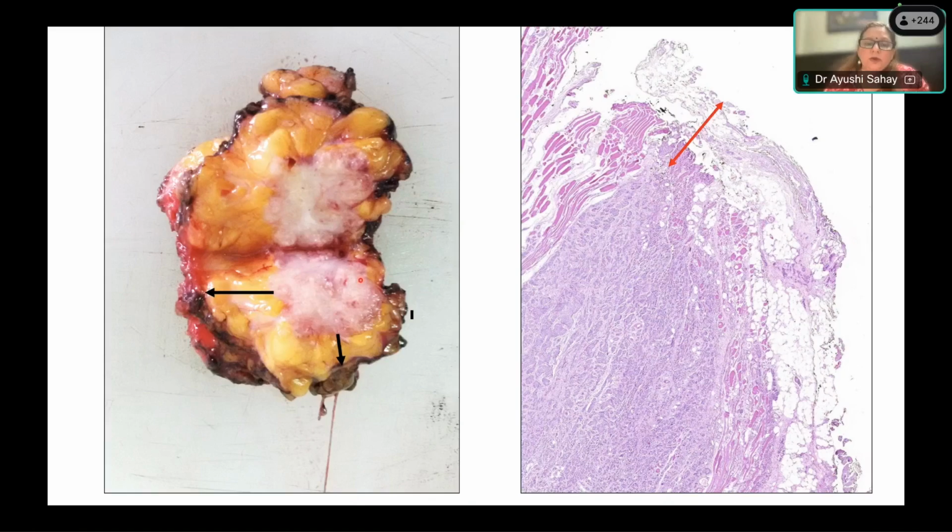Here you can see in this particular area, this section has been taken and the tumor is extending to here. Now there is a little bit of cautery here, but more important, the ink is on this side. So the distance of the tumor from the ink can be measured. In this particular section, you can see how close the tumor is to the margin, but it is actually not positive. In gross, you might be confused, as it looks like it is almost approaching and involving the margin. But here you can measure the distance and see that it is not a positive margin, it is a negative margin. However, it is close. It is 1 millimeter away. So your report can carry all this relevant information if you have given the margin accordingly in a radial manner.